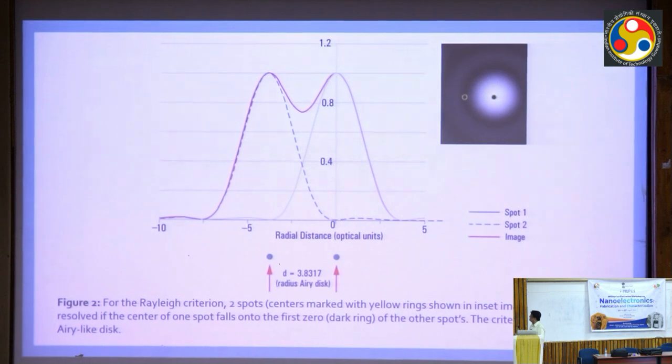Actually, you can see the two spots, how they are well resolved in the process. So these three scientists gave three different mathematical formulas, which I am not putting up here, but continuously the process was developed. And then it was the very beginning of the process called microscope. So once we know about the diffraction, we know the diffraction limit.